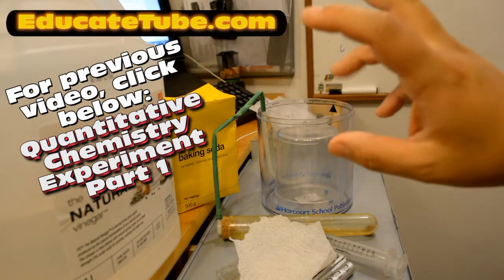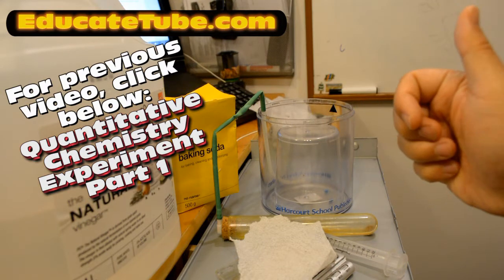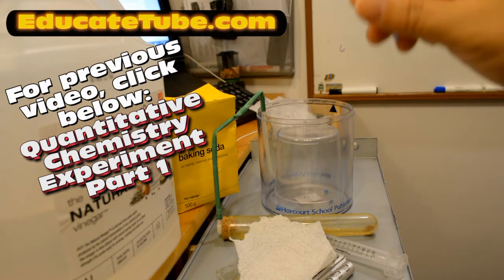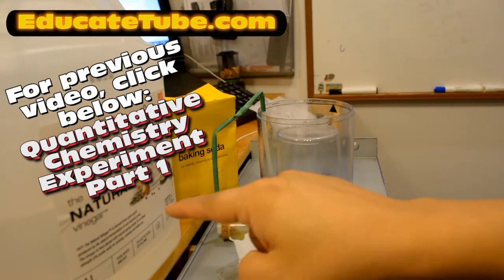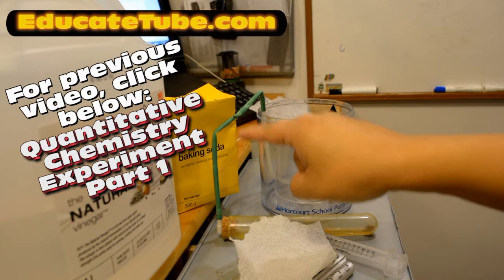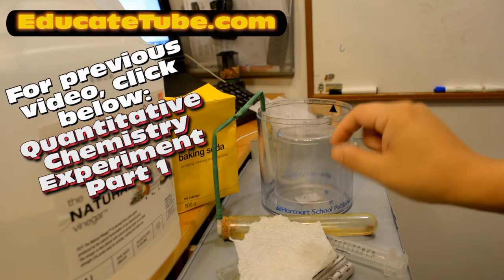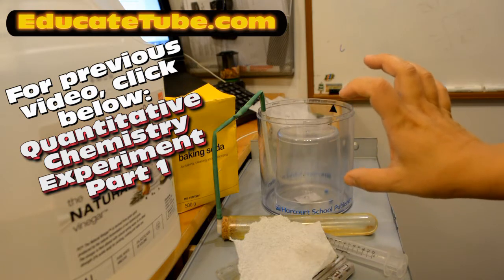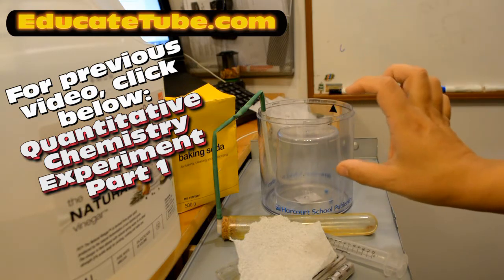Based on the calculation, you can check the previous video on quantitative chemistry, when I add 20 milliliters of 5% acetic acid and 1 gram of sodium bicarbonate, I should, in theory, have 290 milliliters of carbon dioxide gas.